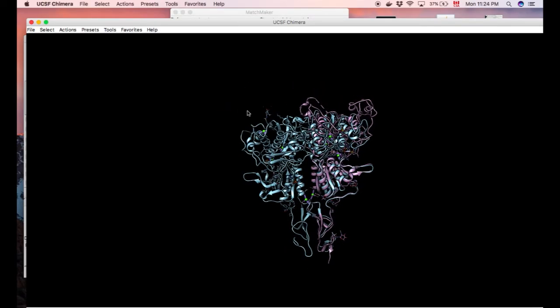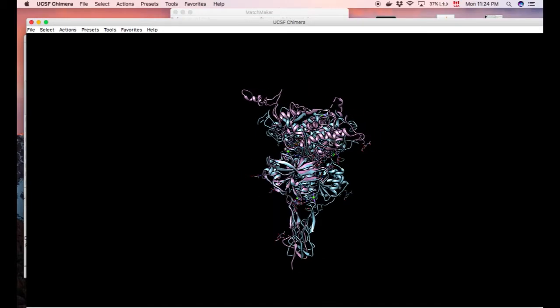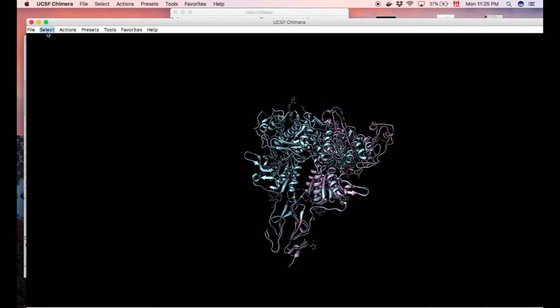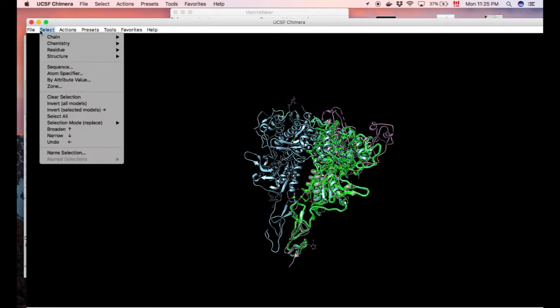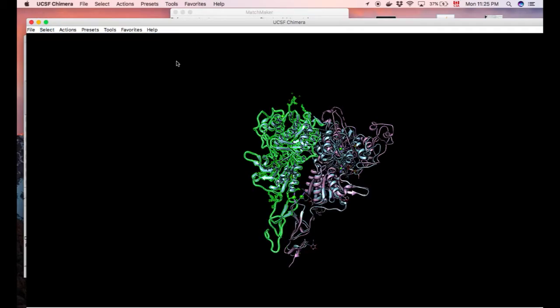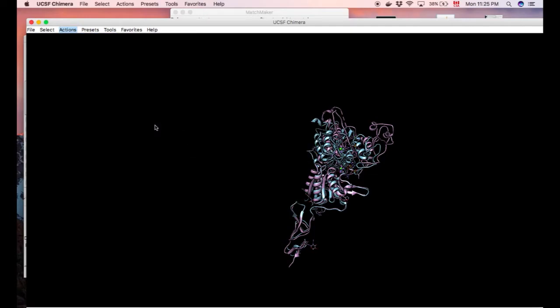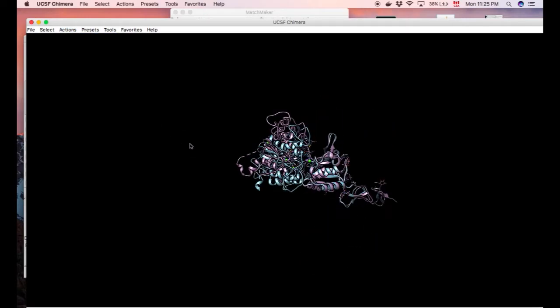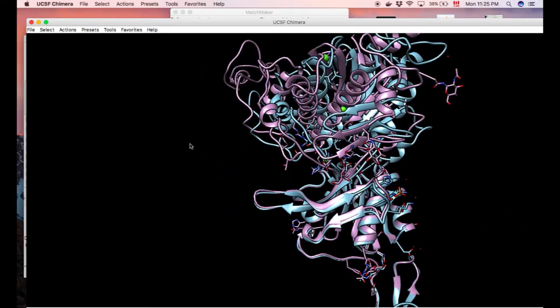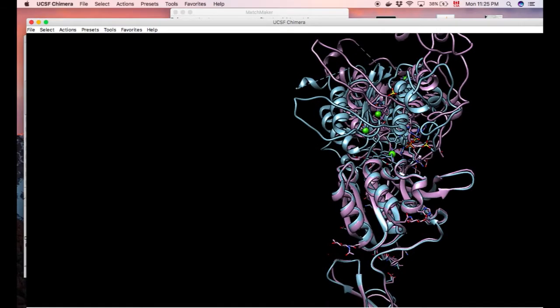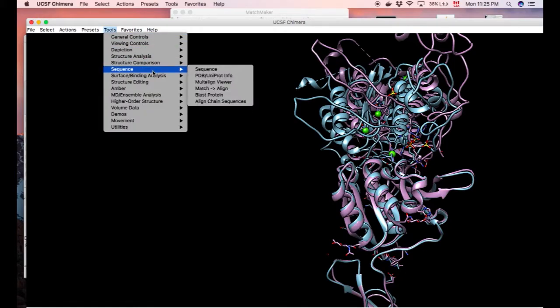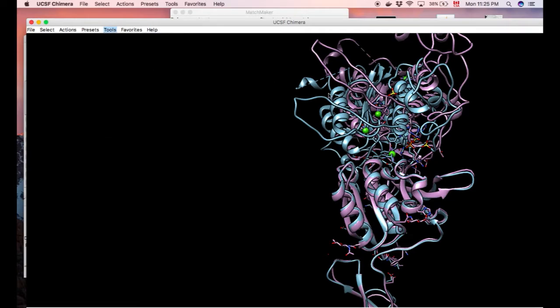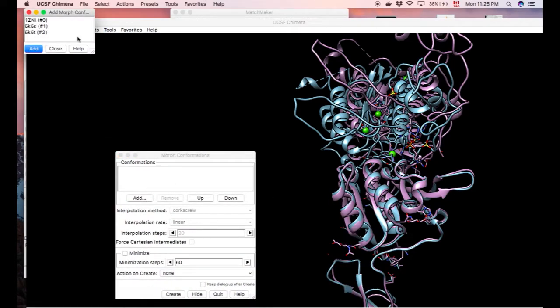So now what we can do is actually delete this and make action video. So video, I'm actually going from this conformation to this conformation. So we're going to select this chain. So 5K5S, this chain, probably the other one. Action, simply delete it. So it's already at the bottom. Perfect. Now we're stuck with a single model. Let's see if we can calculate and animate this transition. To do so, now they're nicely aligned. Just go into structure comparison and morph the conformation.